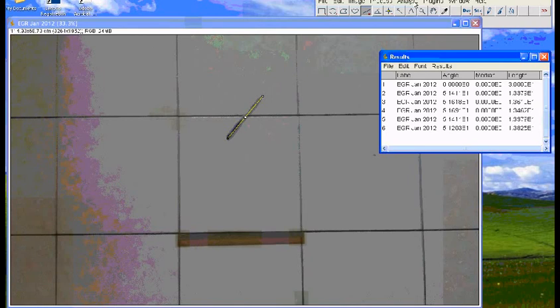Again, another one, I'm not satisfied with it yet. Click on outer space, and then okay, M. It's 13.84.